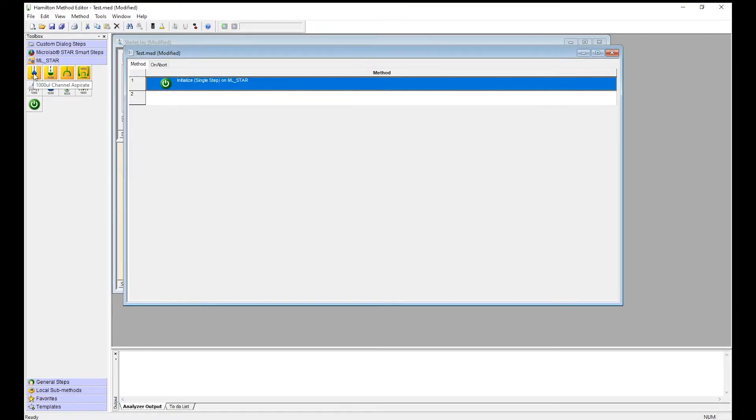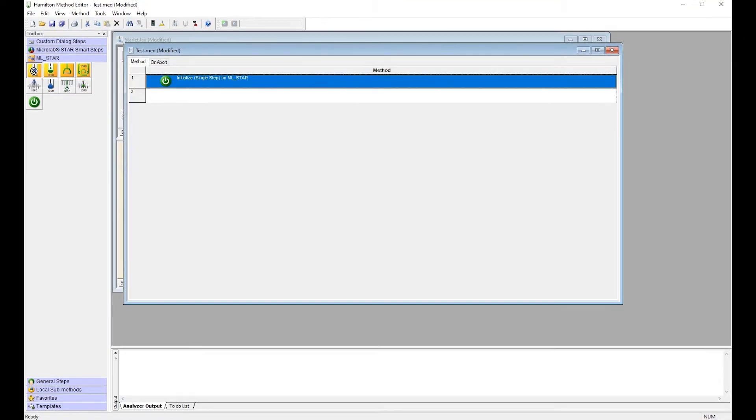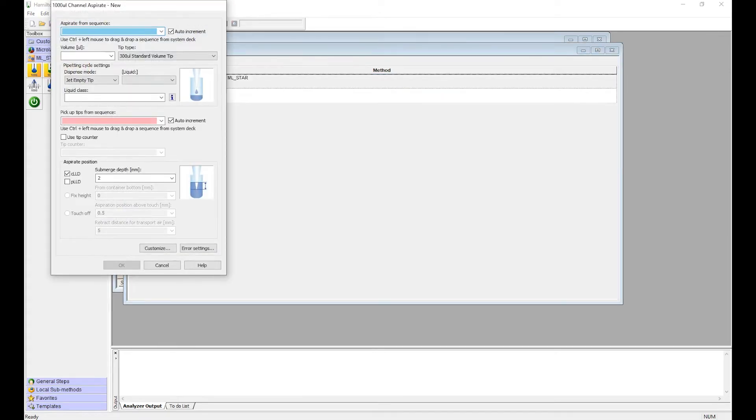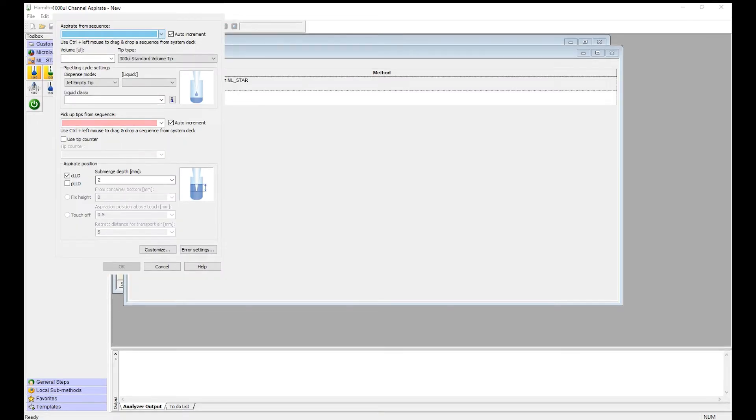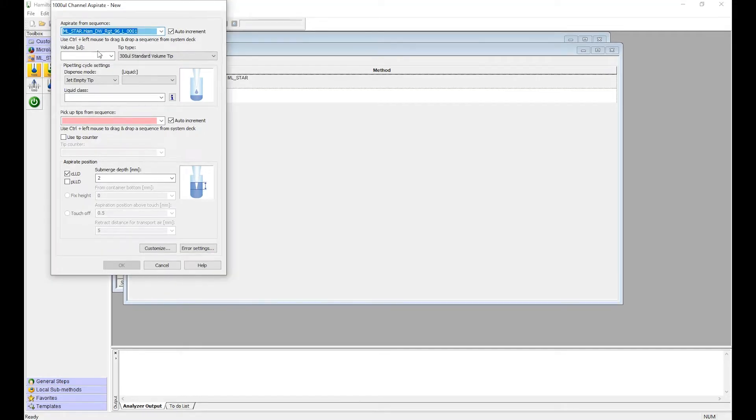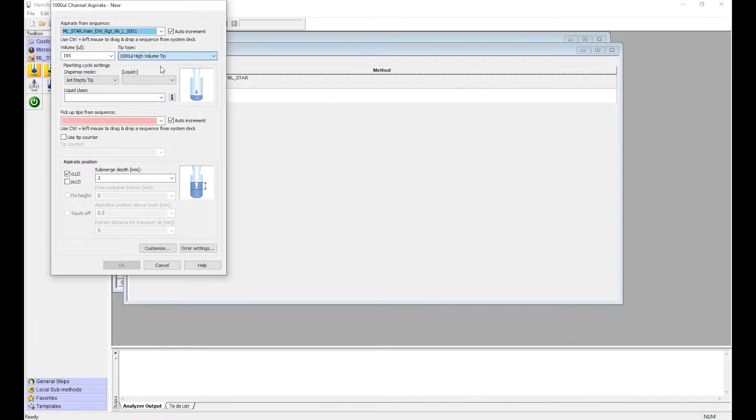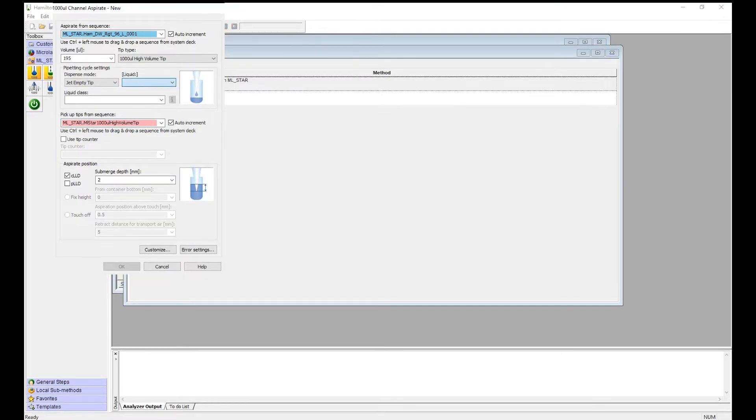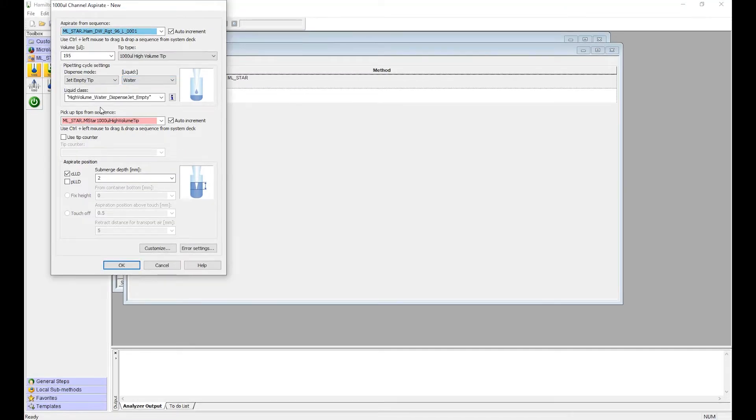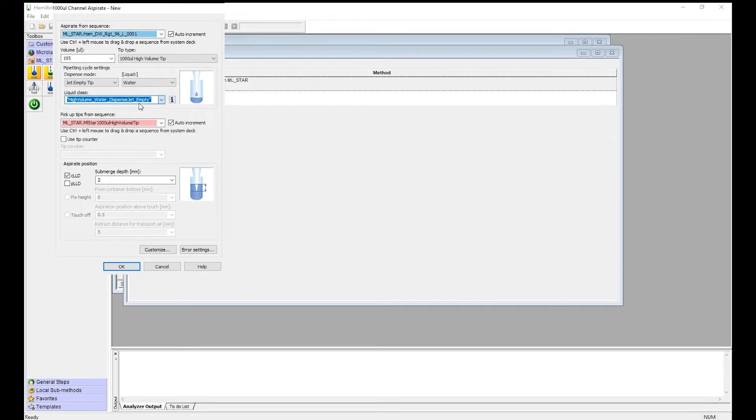Next we want to add an aspirate step for the channels. From this screen we'll select all of our labware to be used. Aspirate from sequence, where you want to aspirate from, which is the deep well plate. The volume, give it a volume. Select the tip type from the list. Select the liquid you're using. We're using water today. It auto-populates the liquid class, but you can select a different liquid class if available.